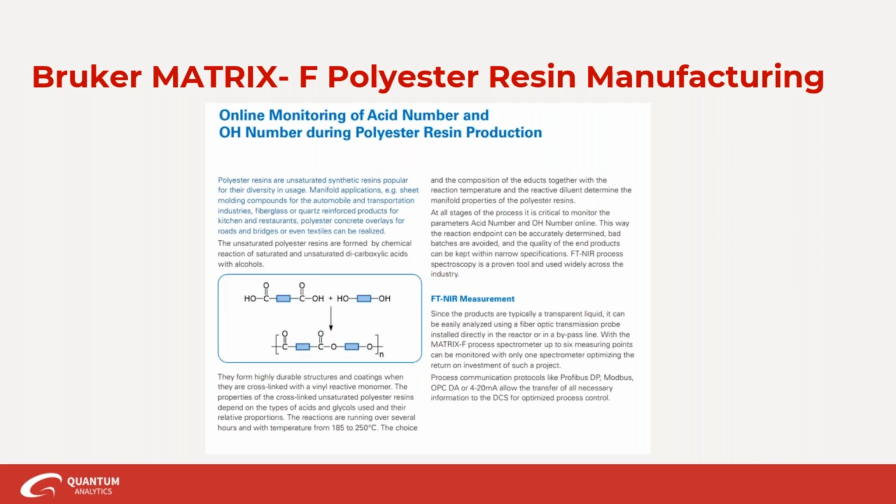And getting the first look here at some of the process communication protocols that are used to transfer the information that you get from the spectrometer to their distributed control system. So this application note is available. If you want to look at it in more detail, contact us and we'll be glad to pass it along to you.